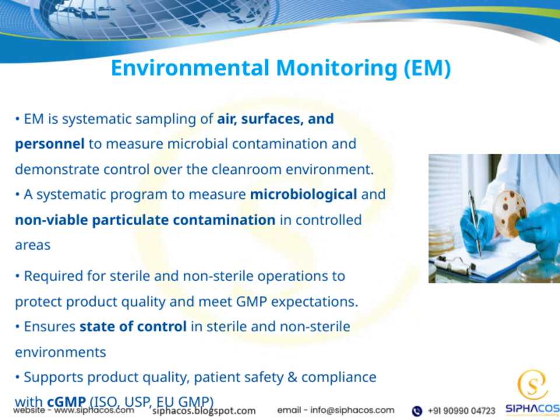This helps us support high product quality, safeguard patient safety, and stay compliant with CGMP standards like ISO, USP, and EU GMP. In essence, environmental monitoring is a critical part of our quality assurance system, ensuring everything stays within the proper control parameters for safe and effective products.